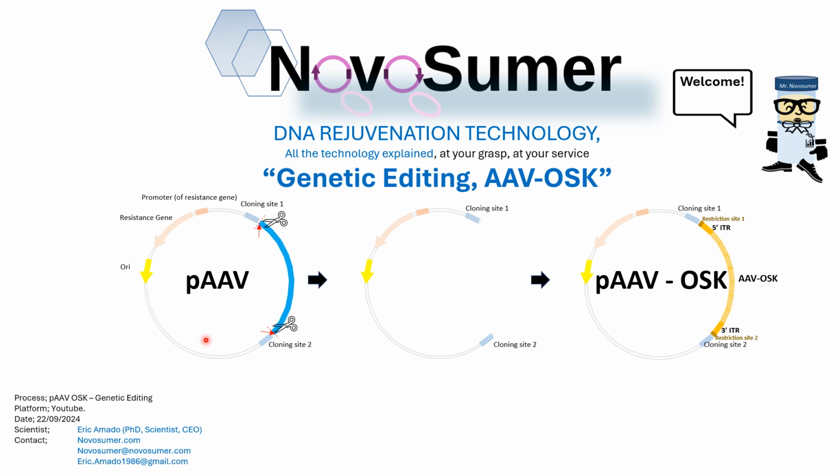This is a plasmid, okay? And this plasmid has information for doing things inside the cells. You see here this fragment. Today we are going to learn how to delete this fragment. You see here, boop, and it goes here, okay? You see here the plasmid now doesn't have the fragment. We have eliminated it, deleted it.